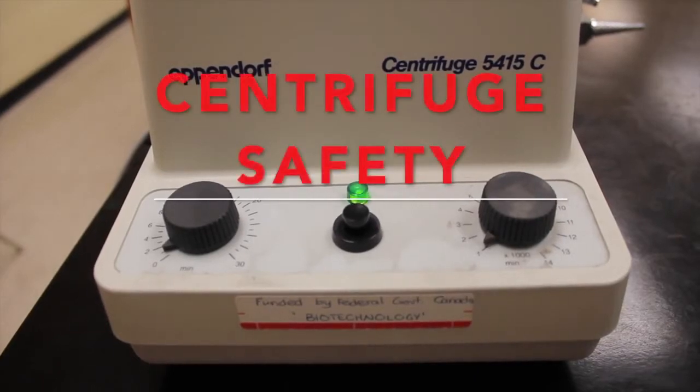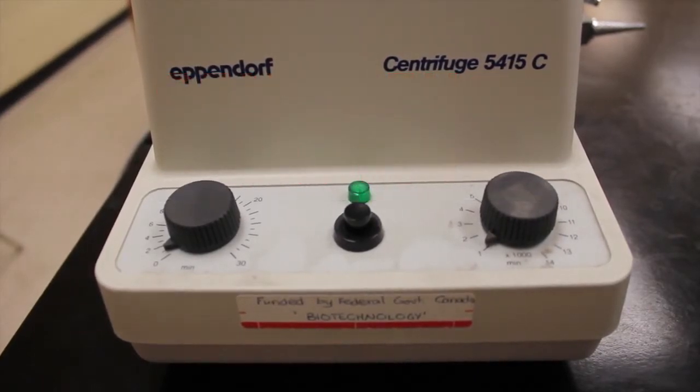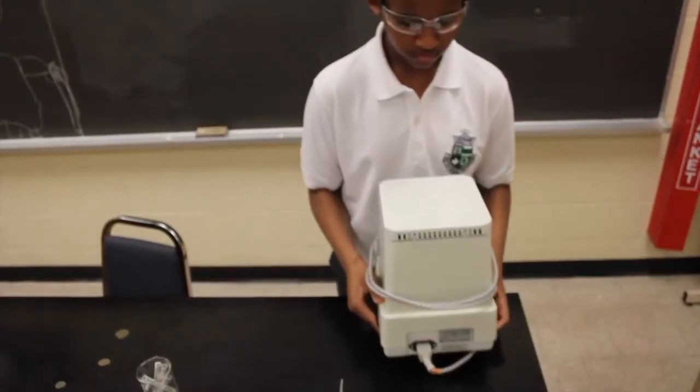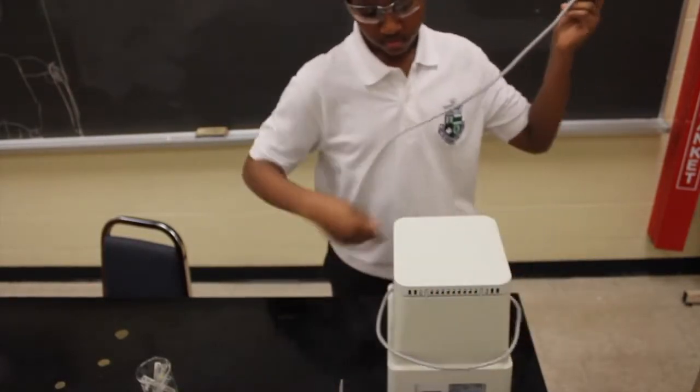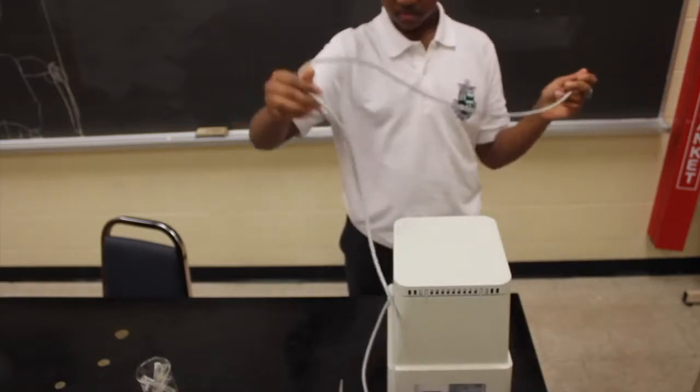Next is centrifuge safety. A centrifuge is an object that aids in separating a solid from a liquid. Upon doing this, the solid will fall to the bottom and the liquid will rise to the top. However, when used improperly, several errors may occur.